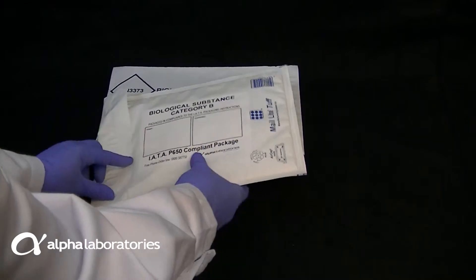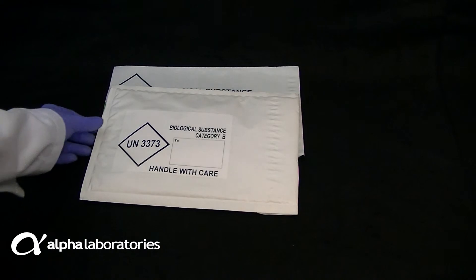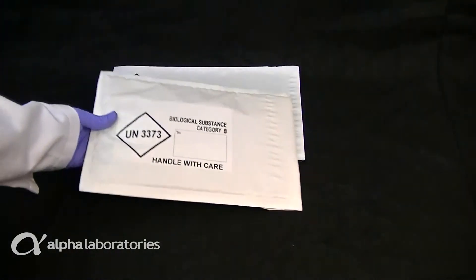Should you have a more bespoke requirement, we can also customise the solution to meet your needs. Mailing envelopes can be supplied with your required address and unique Royal Mail business reply reference.